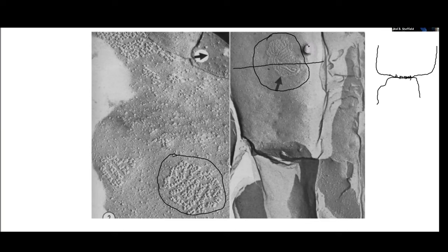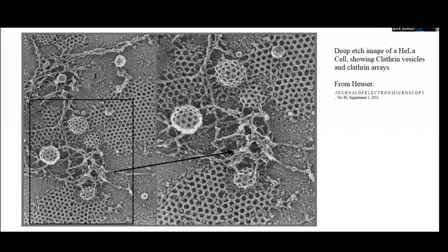One more example of how this stuff has worked. A man by the name of Heuser, whose paper I'm posting for you, who did a terrific review, and I'll talk about that review once I show you his pictures. He discovered that under the right circumstances, you can deep etch a cell. So, here's what he did. He has a cell, again, fractures through it, and then etches, instead of just etching a little bit, so that you just get sort of this edge of the membrane. He etches away all the water all the way down to the very membrane surface of that cell, so that now what he's looking at is this surface, which has some interesting depressions or pits on it, if you will. And these are clathrin coated vesicles.